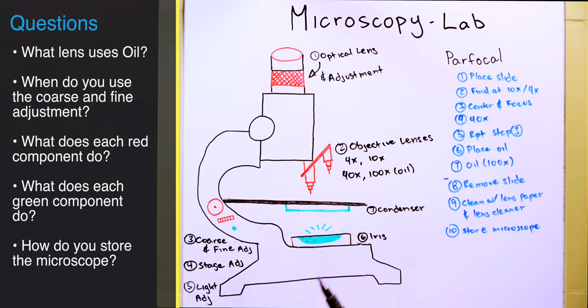Bring the condenser all the way to the 4x. And then if there's a cover, put the cover on and put it away in the cabinet. This was another question that was always on my lab practicals. They wanted to know that we were storing the equipment away because the schools didn't have enough money to just buy microscopes left and right.